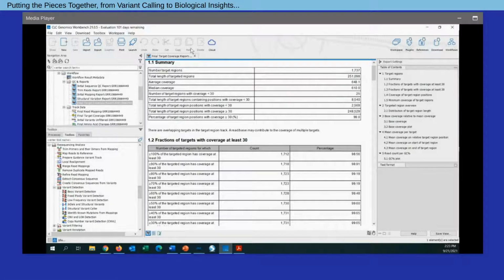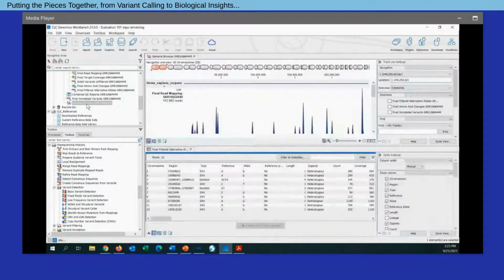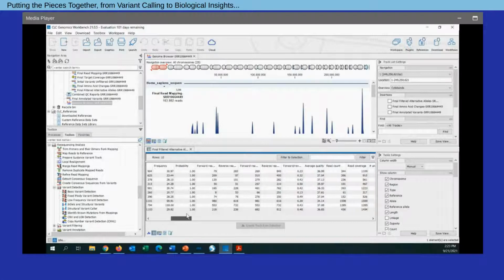Now, there are other various pieces of output for this analysis. Typically, you would find that under track data, you can get the mapping information, the pre-filtered variants, and a number of other things. But really, the key endpoint that I want to show everybody is this genome browser-based view. And this is a very nice integrated view where, similar to what I showed on the slides, at the bottom of the screen here, we have a table of all the called variants. Within this table, we have positional information, zygosity, coverage, frequency, and metrics related to variant confidence from the caller.